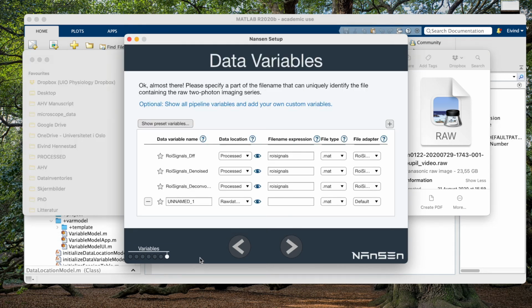So I go back here and give it a name, which I call pupil video, and I enter pupil video in the file name expression, because all my pupil video files have this part in their file name. This was a .raw file, and it can be opened using the ImageSec file adapter.